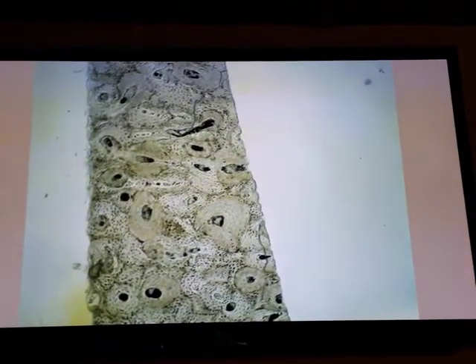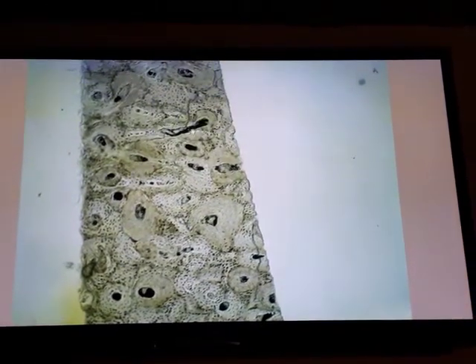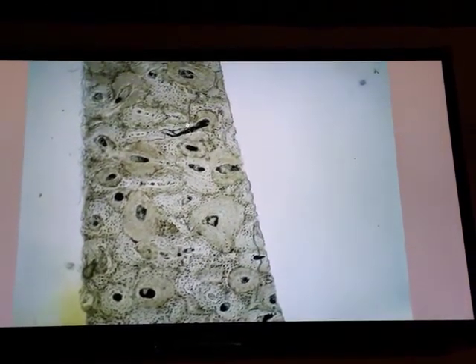This is the Volkmann's canal, which connects between two Haversian canals. It runs transverse or oblique. Both canals are surrounded by laminae, but Volkmann's canals do not have concentric laminae, unlike the Haversian canals.